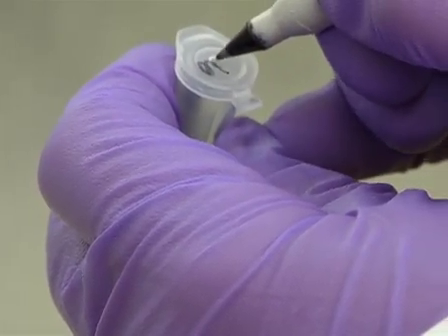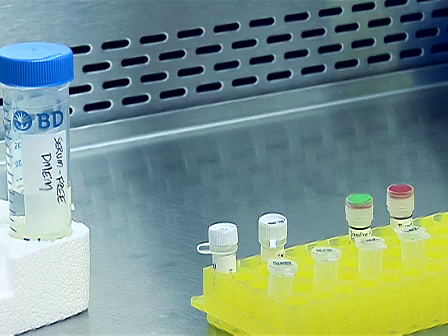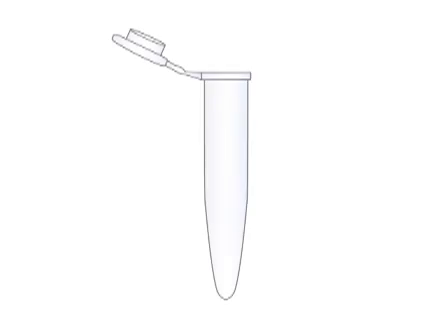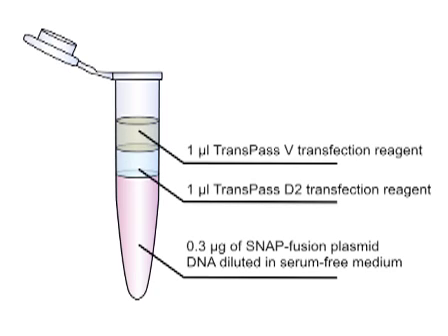Label the appropriate number of microfuge tubes for the transfection complex mixtures. In a laminar flow hood, set up the transfection complex mixtures. For each reaction, use 0.3 micrograms of SNAP fusion plasmid DNA diluted in serum-free medium and 1 microliter each of the TransPass-D2 and TransPass-V transfection reagents.